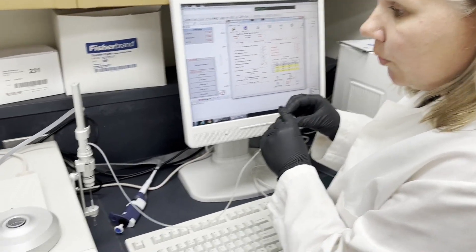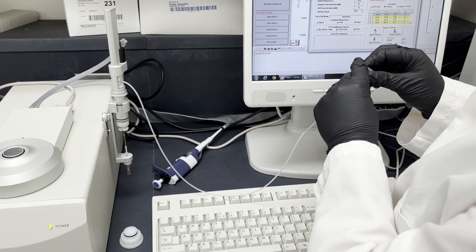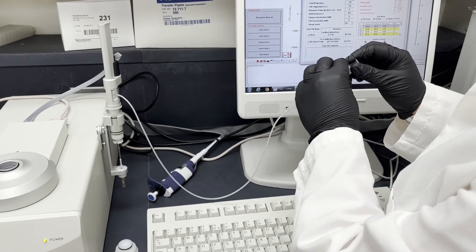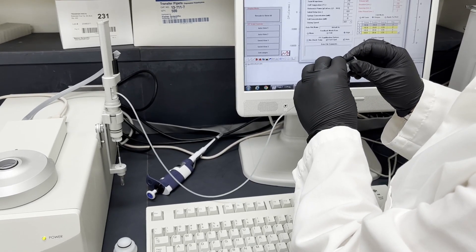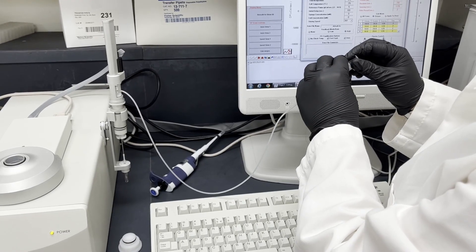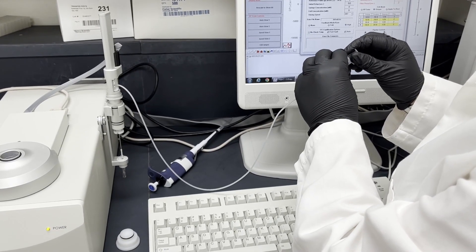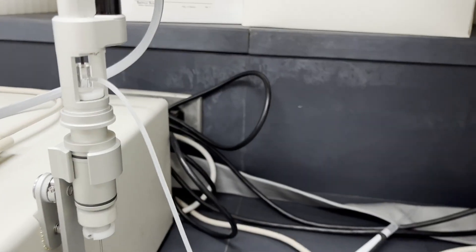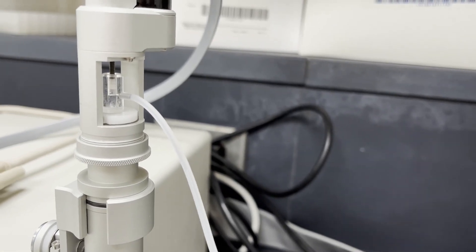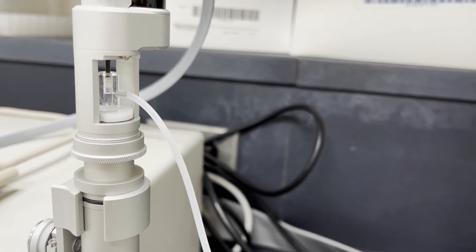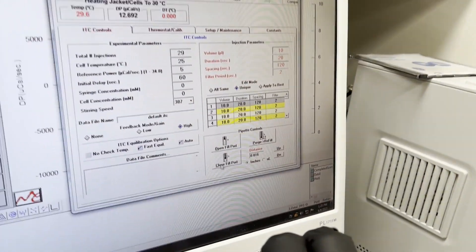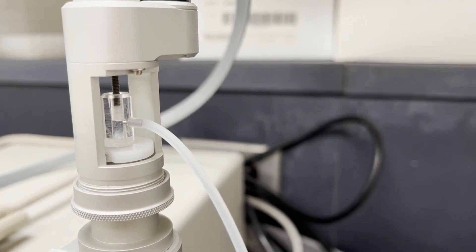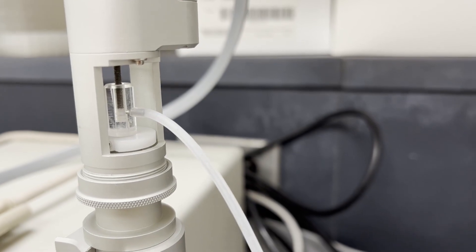Now we're loading our titrant sample. I hooked up this tubing to the fill port there. I'm pulling back slowly. You don't want to pull it back so fast that there's air at the bottom of your injection syringe, so you can see it slowly coming up here. You can see that there's a little bubble at the top, so what I'm going to do now is go to the computer, hit close fill port, and then also pull back a little bit as it's going. And now that bubble is pretty much gone. So it's in the closed port position.